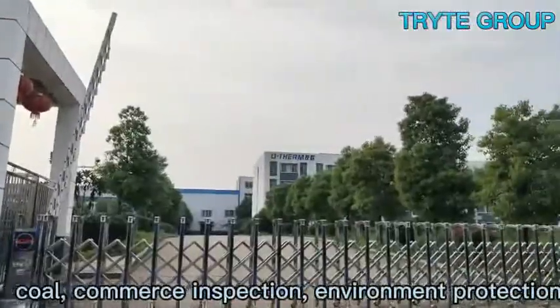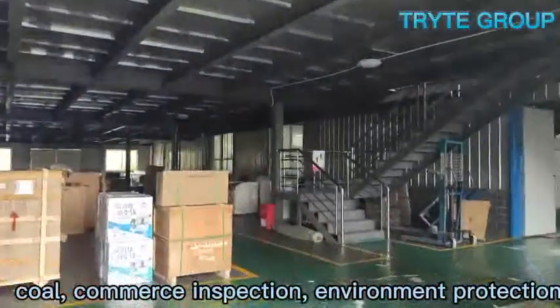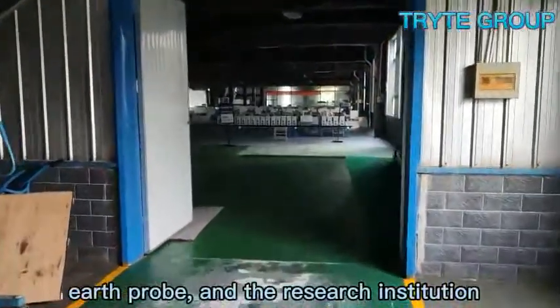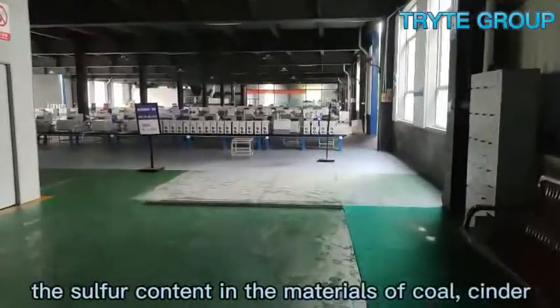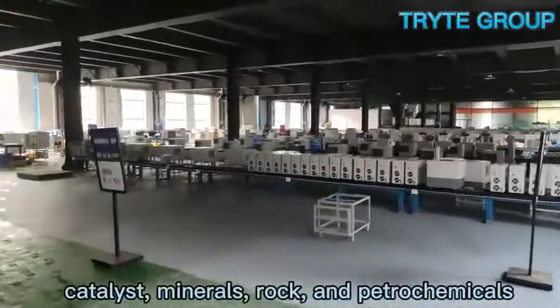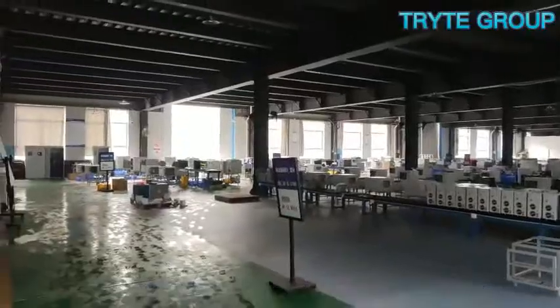It is applicable in industries such as electrical power, coal, commerce inspection, environment protection, metallurgy, paper making, petrochemical, earth probe, and research institutions or quality inspecting organizations, to measure the sulfur content in materials such as coal, cinder, coke, catalyst, minerals, rock, and petrochemicals.